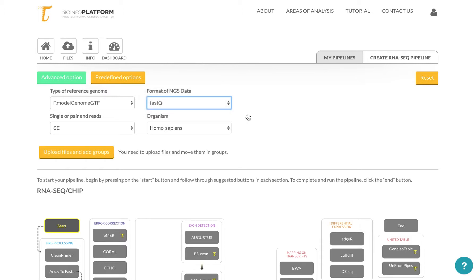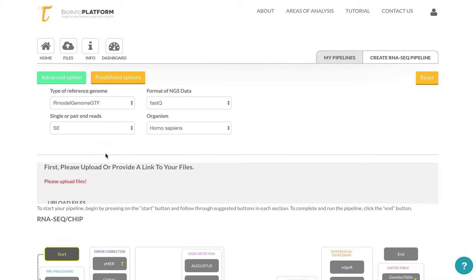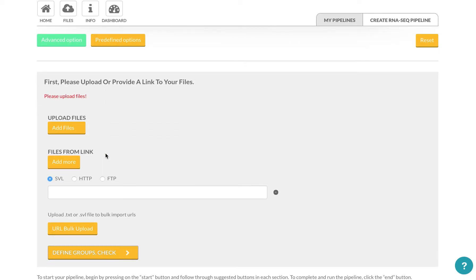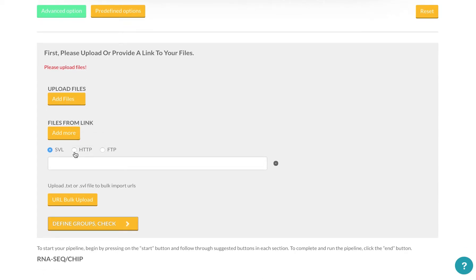Now you can upload your files. You can either upload your files from the computer or use links, HTTP or FTP links, as well as an SVL, which is a reference link to the files that are already on the server.